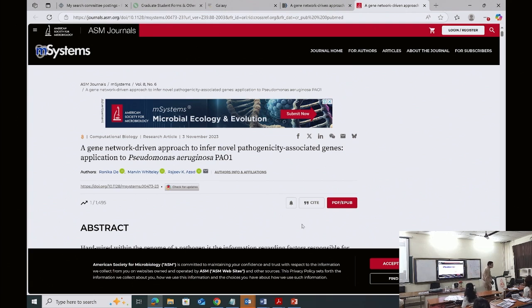I don't know which transcripts those are. I want to find out the transcripts. Oh, you don't know, actually. That is fine, but you know the functions, right? So you can then screen for functions; functional analysis you can do. There are programs that can annotate functionally, and then you can do the functional enrichment analysis or pathway enrichment analysis of the modules and see if those functions are represented in those modules which have enrichment of differentially expressing genes. So this way you may be able to identify them.